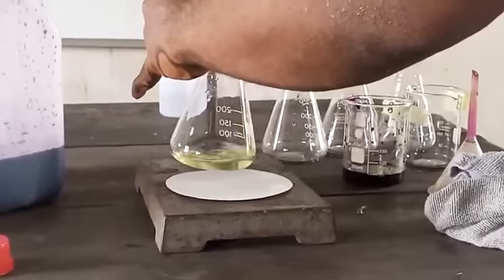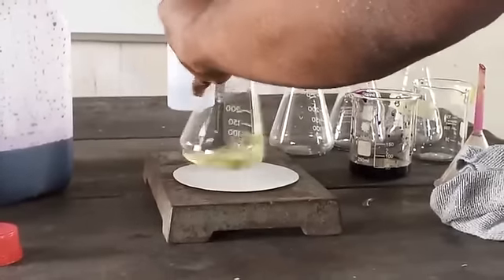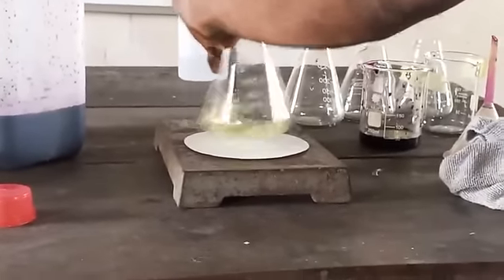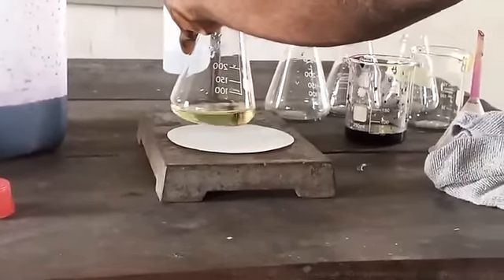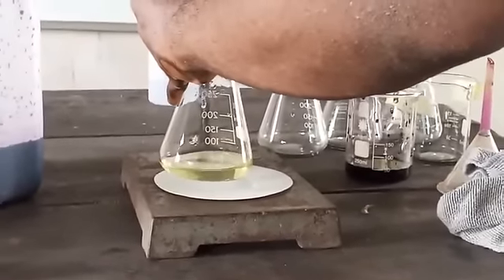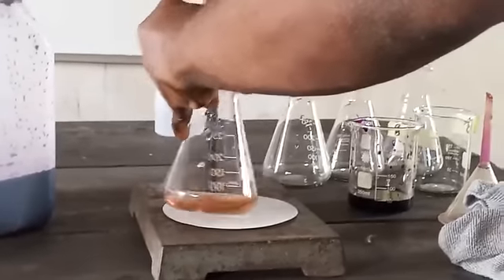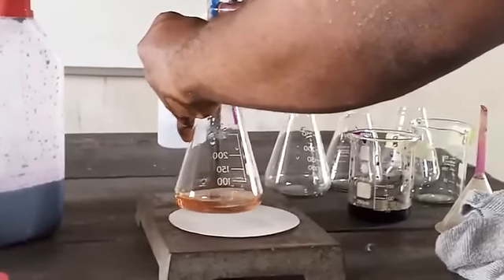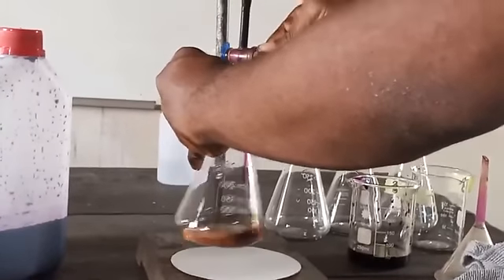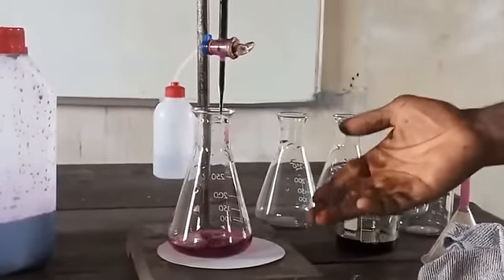Take it drop by drop. We're getting to the point. You see, it has changed. We add one more drop. It's somehow brownish. We add one more drop. That's okay. You see, that's the end point.